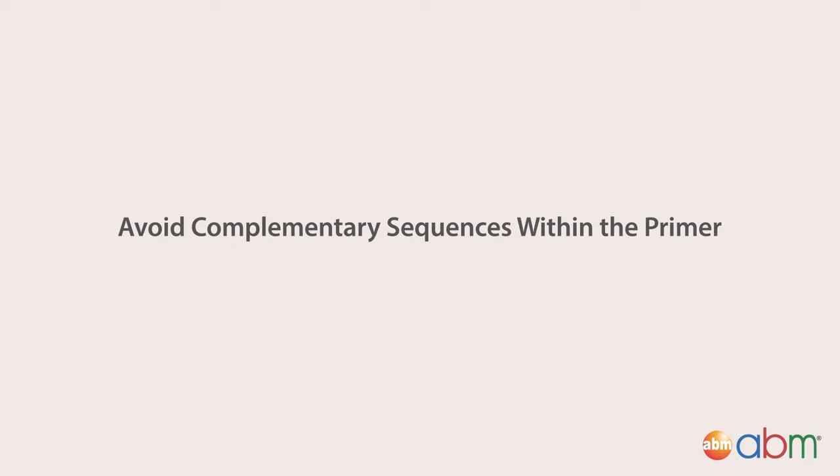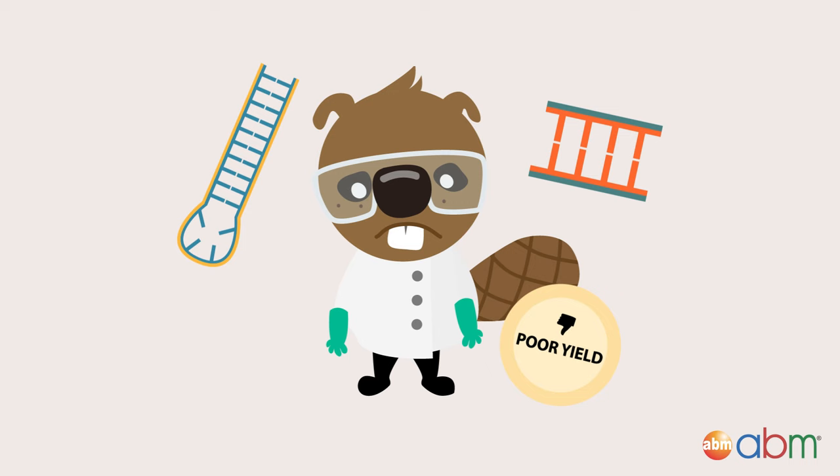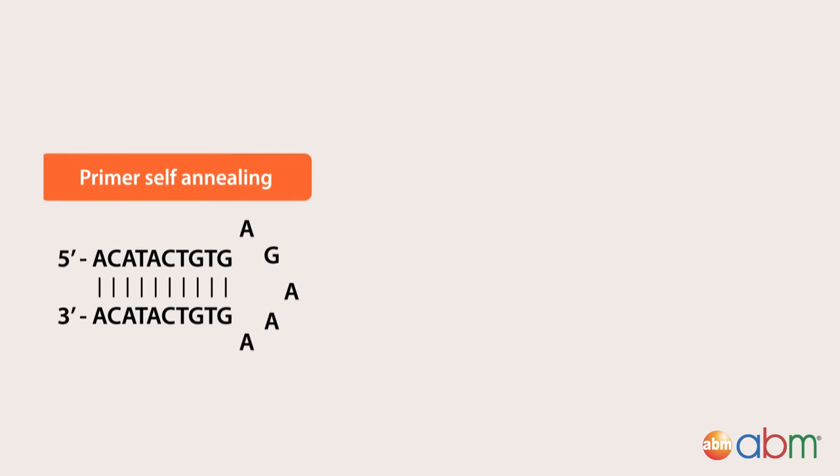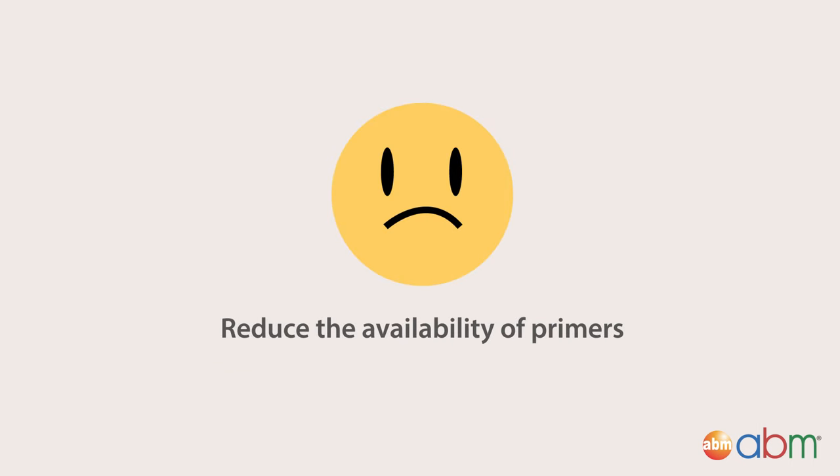Avoid complementary sequences within the primer. Any complementary sequences within the primer or between the forward and reverse primers can lead to poor or no yield of the product. This is because intramolecular or intermolecular interactions lead to self-dimers or primer dimers. Both situations will reduce the availability of primers to bind to their intended target sequence.